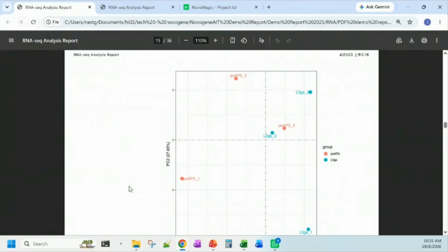We don't really see very big differences before and after eating the supplement. This is when we look into the overall changes, because if the expression profile changed drastically after eating the supplement, then that might actually indicate something wrong, because supposedly our normal gene expression should function like before eating nasi lemak or after eating nasi lemak, not so much different.